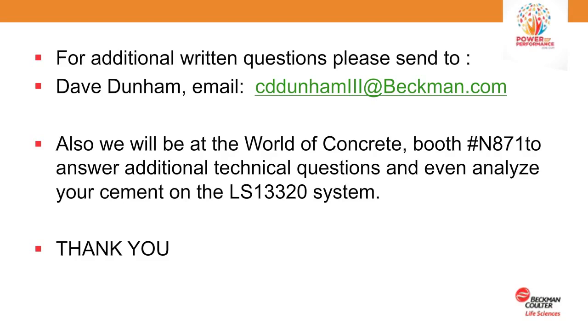How many samples can I run in a day? If you're running dry, that's going to be the quickest way, since you're not having to rinse the module. Your typical analysis time might be between a minute to a minute and a half per sample. So you could run 40 samples in an hour running dry, if you have samples available and ready to feed.